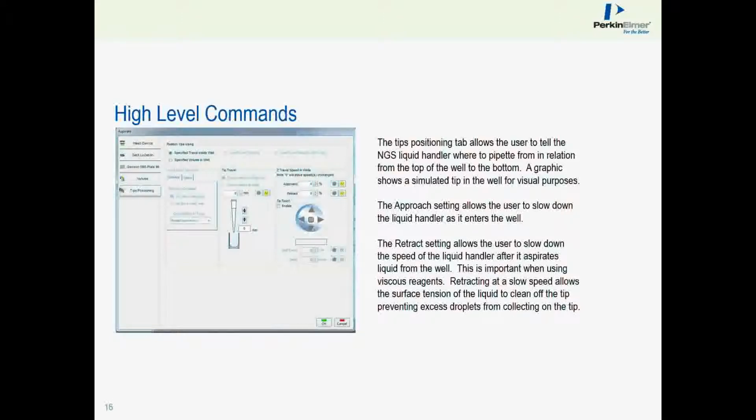And these depths can be obtained through the manufacturer website from the producer of that labware. Because we have all that information stored in the consumable database, the values that we give for the depth are controlled and limited by the actual consumable depth.